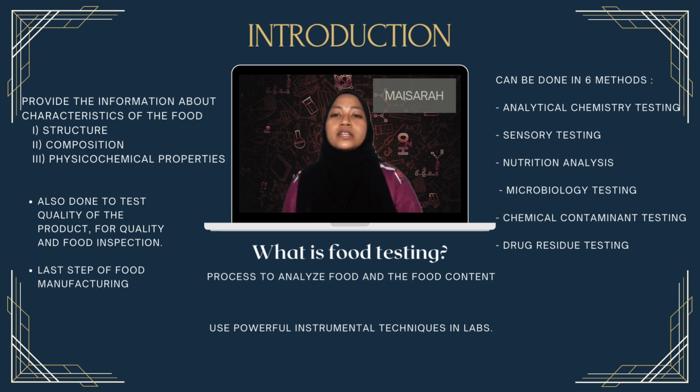Food analysis uses powerful instrumental techniques used in labs to increase the specificity, precision, analytical accuracy, and detection limit in food testing. The food sample that will be used for this assignment is from bees, which is honey. Honey is composed of carbohydrate.